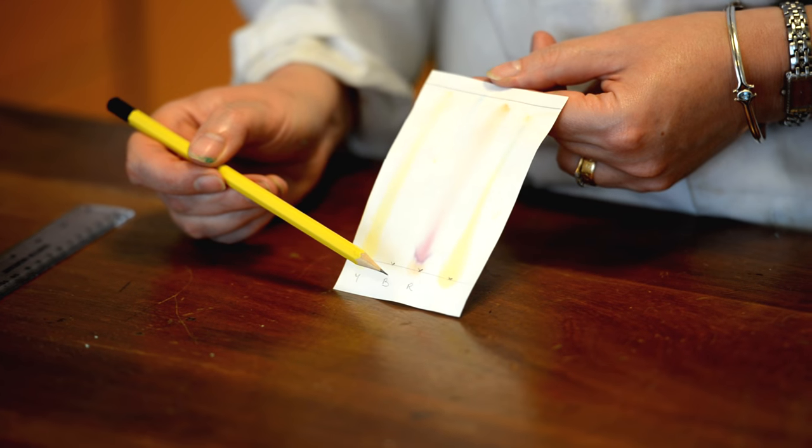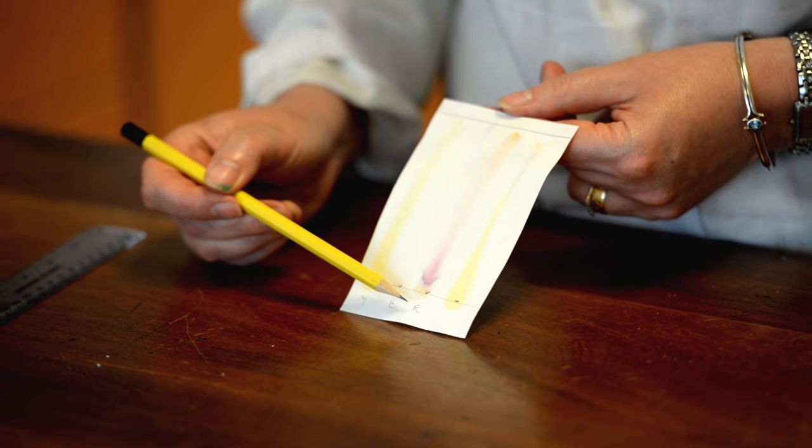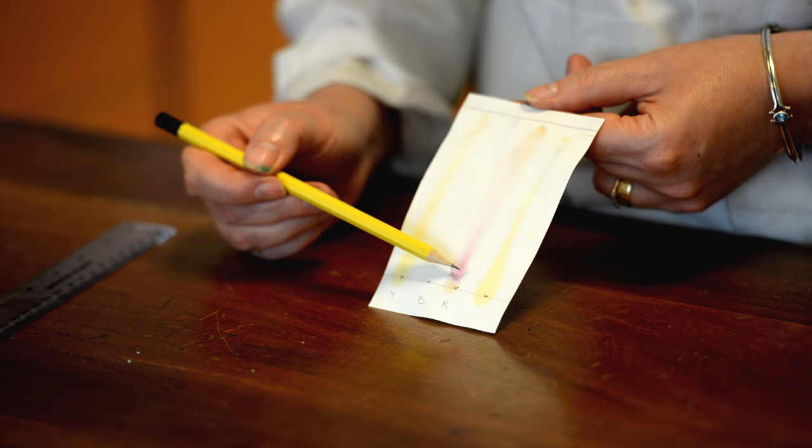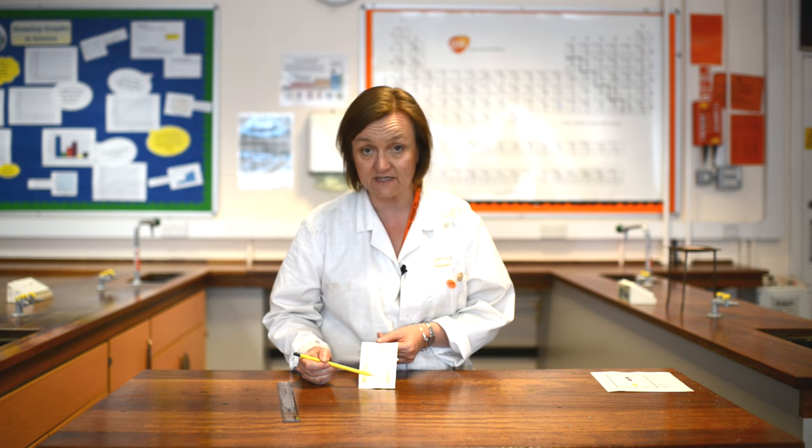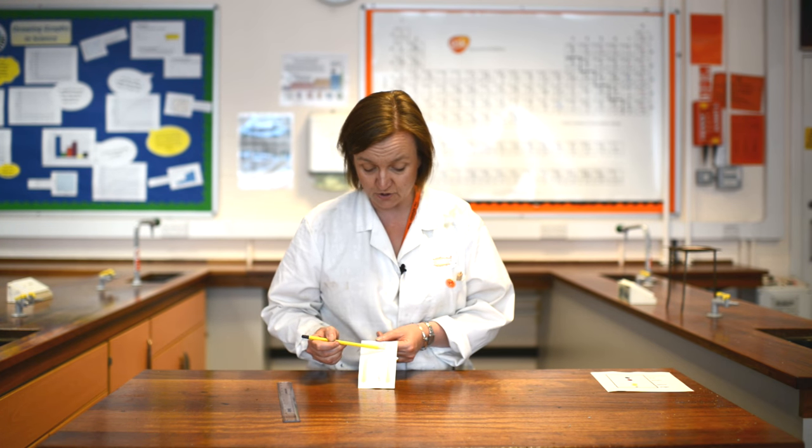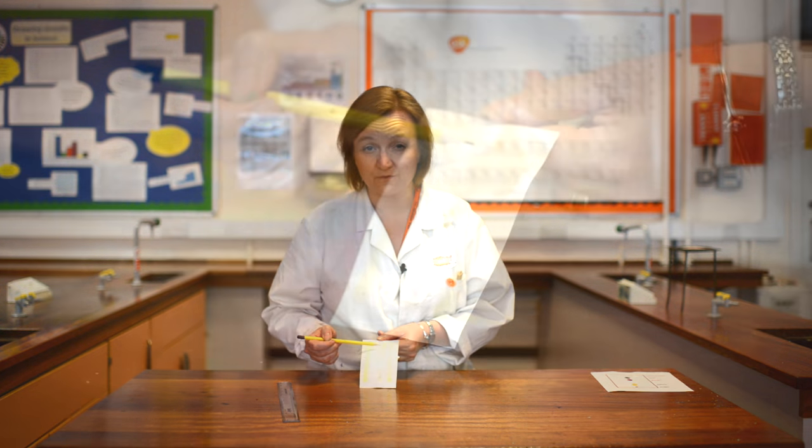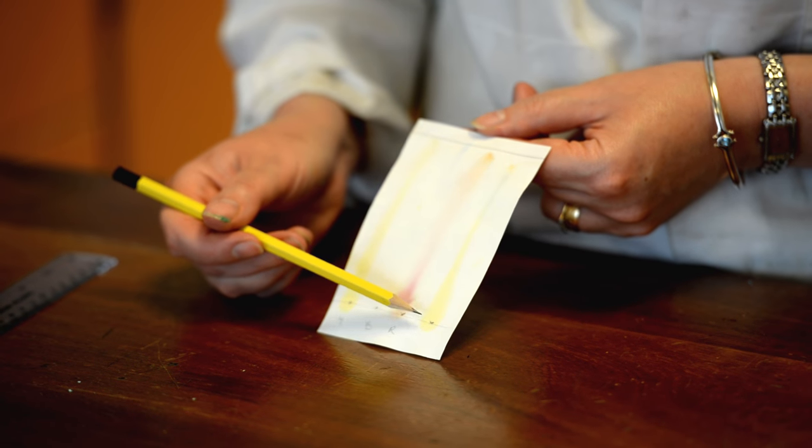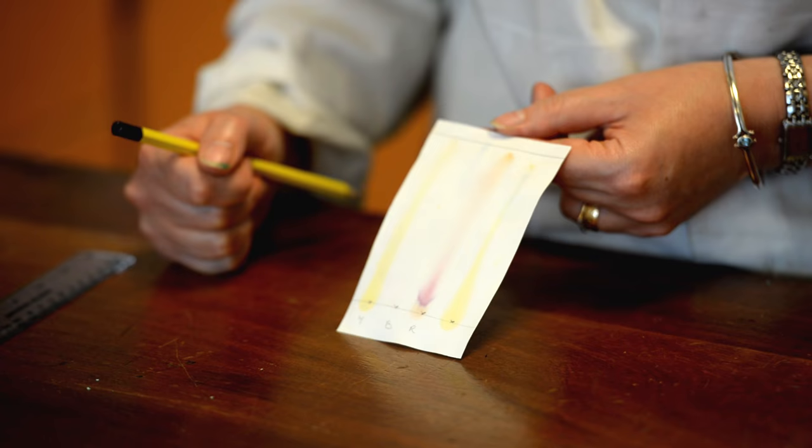We can see it's absolutely nothing like the red at all. Here's the red, and actually this isn't a pure color because you can see we've got a kind of purple at the bottom here making a very distinctive dot, and then at the top you've also got this kind of orangey mark. So the red food coloring wasn't pure, but there was none of it in our green at all.